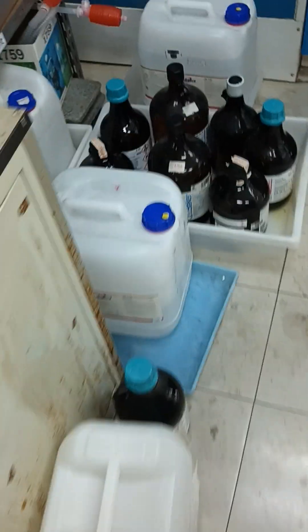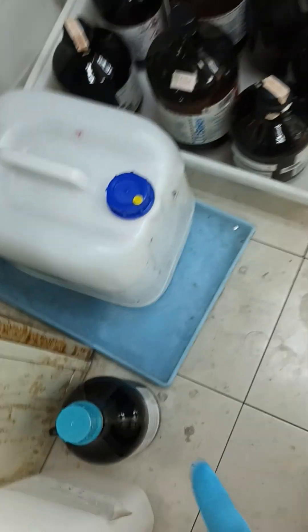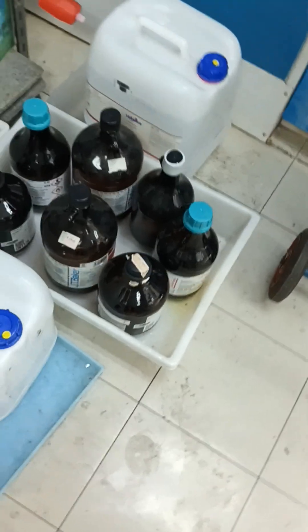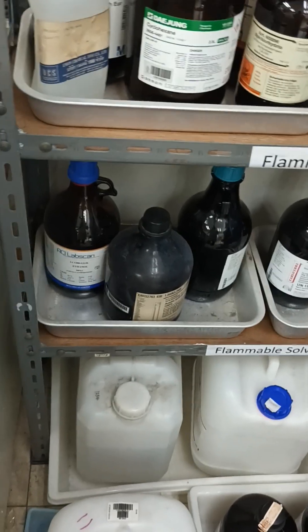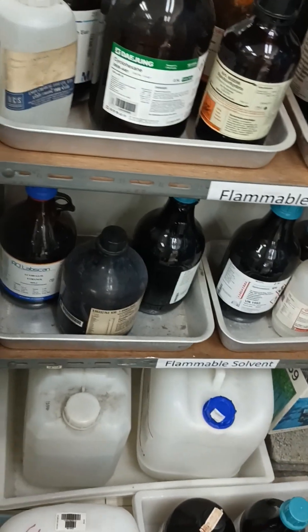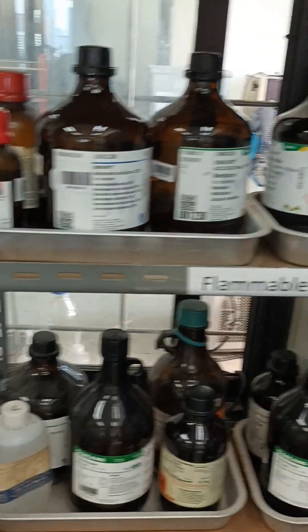Let's look at solvents like ethanol and methanol — they are here. These are in secondary containers, because if they spill, it prevents any accidents. It's necessary to put them under secondary containers. If it is a flammable solvent, you must use the aluminum-based secondary container. If it is ethanol or methanol, you can use plastic. If it is reactive, we must use the aluminum secondary container. This fume hood here is for sucking out any volatile material and removing it.